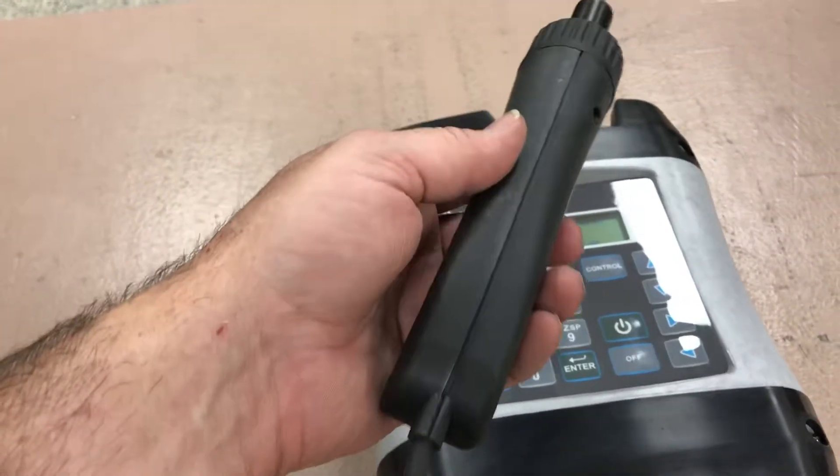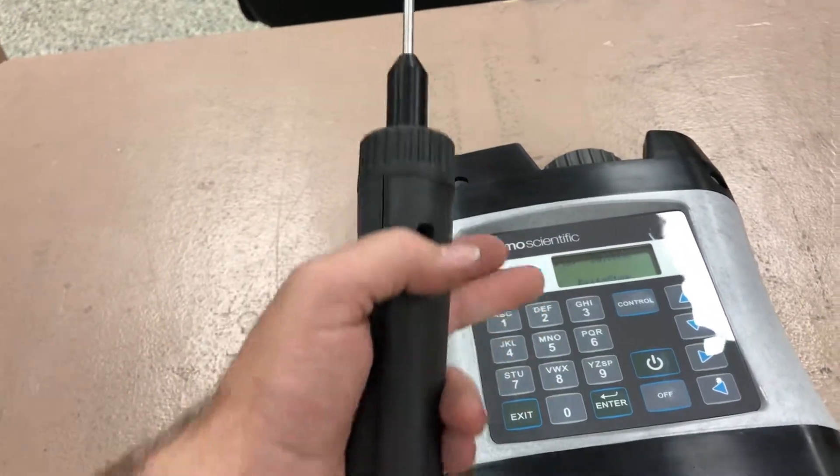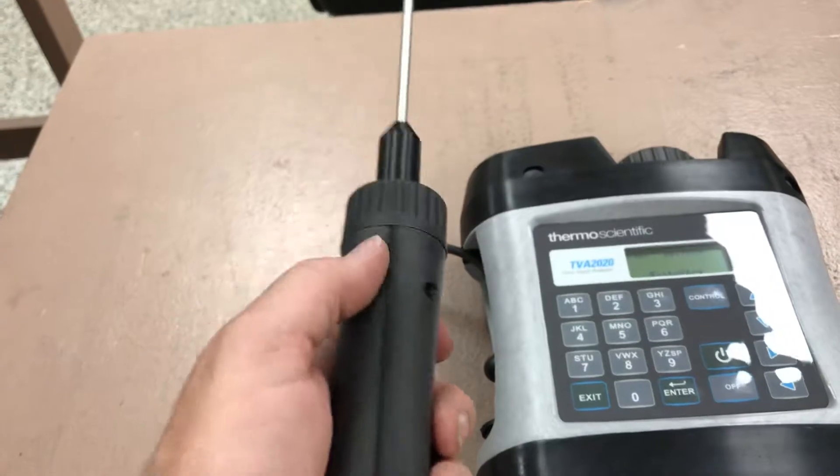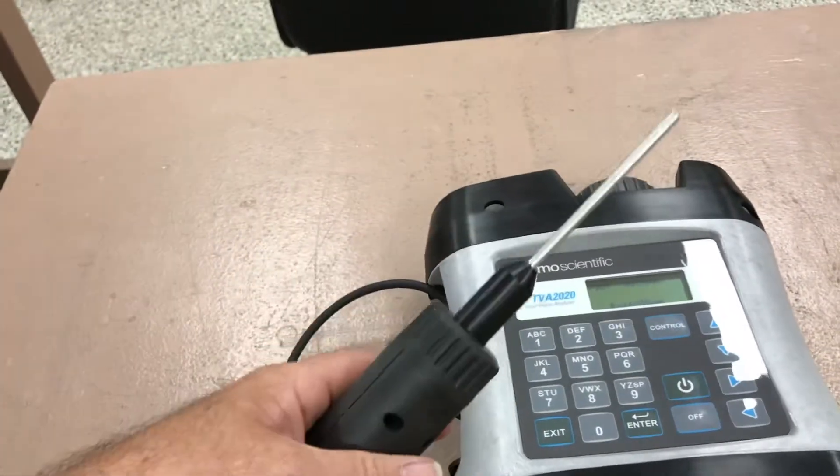This is the sample probe — just a very basic tube. There's an option for an enhanced sample probe, which includes a remote display so you can see the numbers on a handheld as well as on the main screen. This option is just a simple straight sample tube.